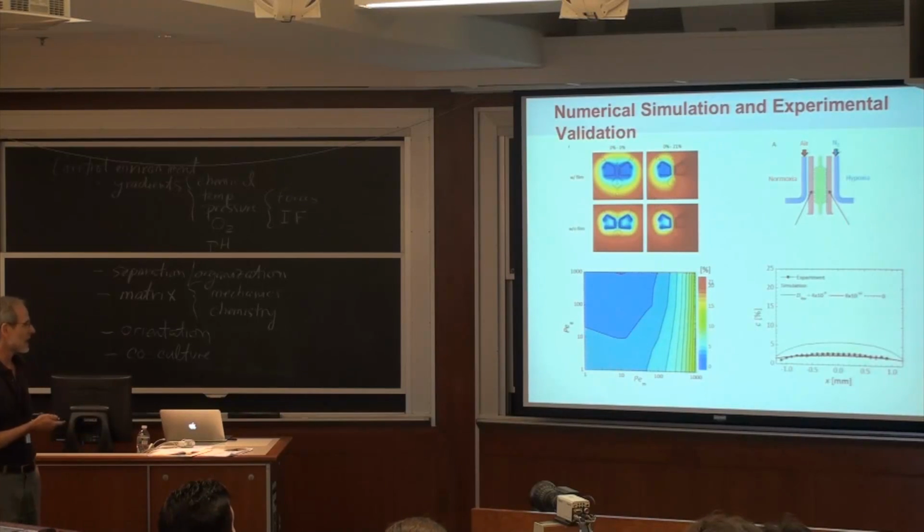And then we've checked this out. We've done experiments to validate it. So the simulation corresponds to these solid lines and the experiment corresponds to the boxes. And depending on the diffusion, we actually introduced a film just above the region because there's too much gas diffusing out through the top of the device. When we put that film in, we get good agreement between the measurements and the numerical simulation.